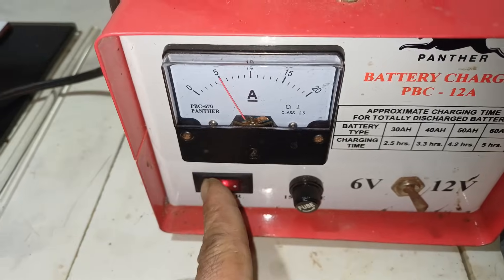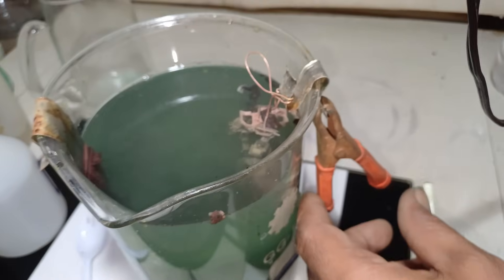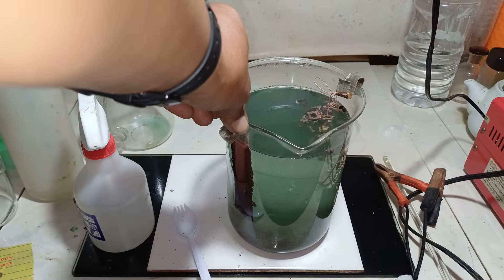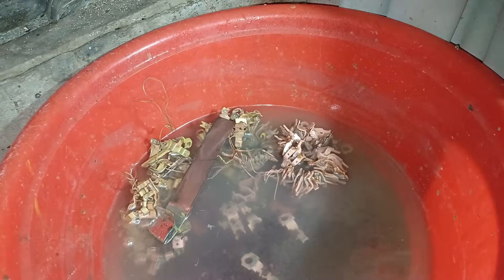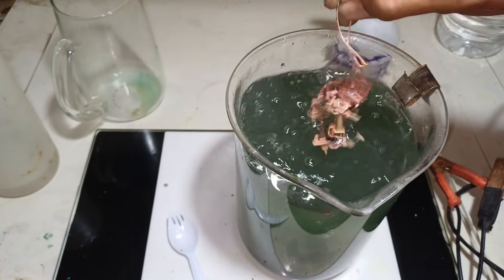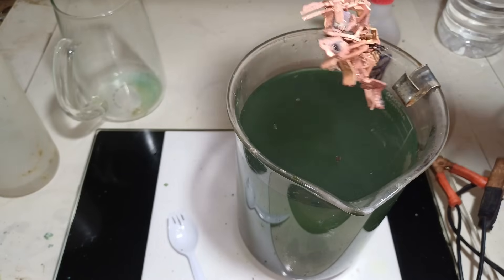We turn off our power supply and remove the negative anode and positive. As you can see, this is copper. We remove the cemented copper here — maybe mix this one with silver. There's a lot of extracted copper from our material. As you can see, very clean. We have successfully removed our silver plating.